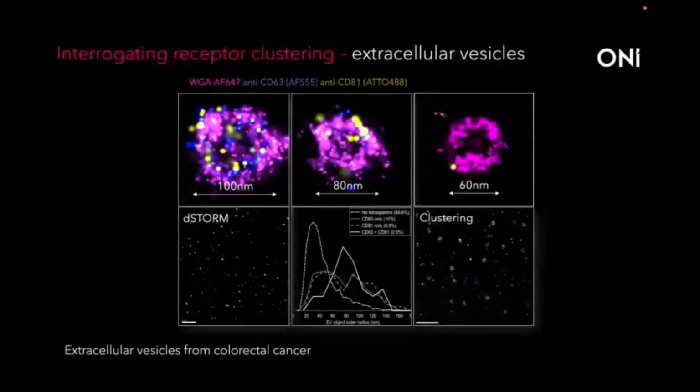So here we can then plot, for example, the size of the EVs, how that changes, but also the relative abundance of different molecules on it. So that could be PD-L1, that could be diagnostic in the case of direct patient care, or it could be for research purposes in terms of understanding how the immune response changes with different treatments.